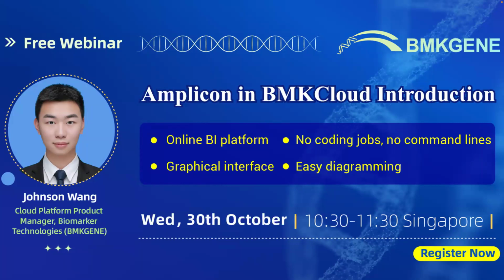This session will empower you to maximize the potential of BMKCloud for your microbial diversity projects, giving you hands-on knowledge to enhance your research efficiency and data analysis capabilities. Whether you are new to bioinformatics or looking to optimize your workflows, this webinar will provide valuable insights to advance your studies.